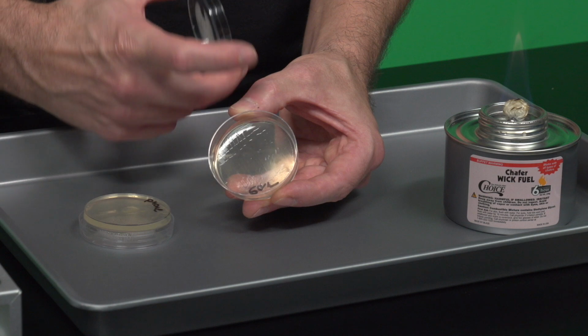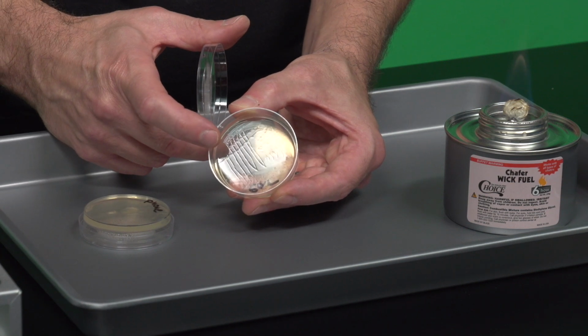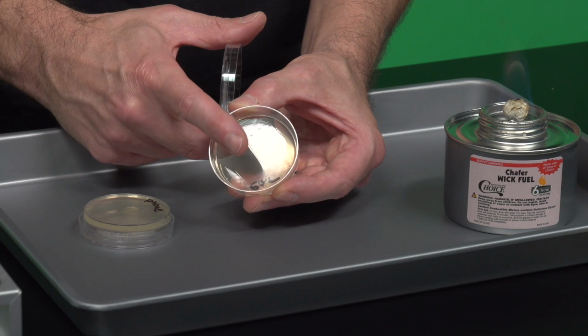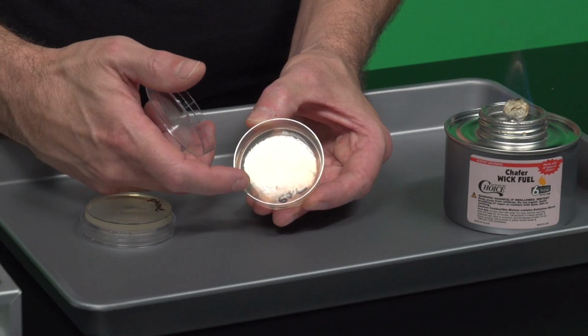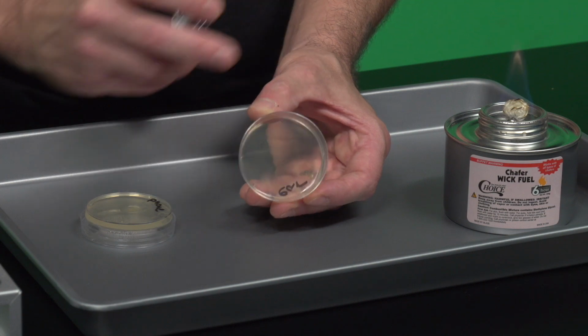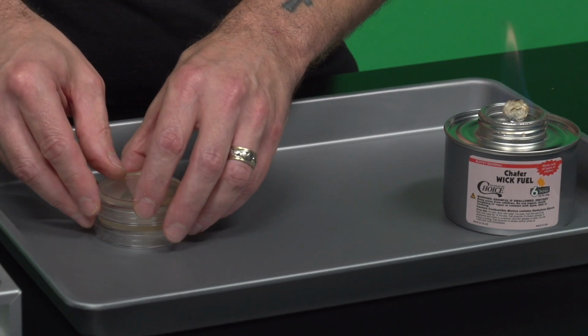It then went into quadrant 2 over here, and then brought it into quadrant 3 over there. And quadrant 4 is that little squiggle right there. Okay, so hard to see, but on your plate you should definitely be able to see it.